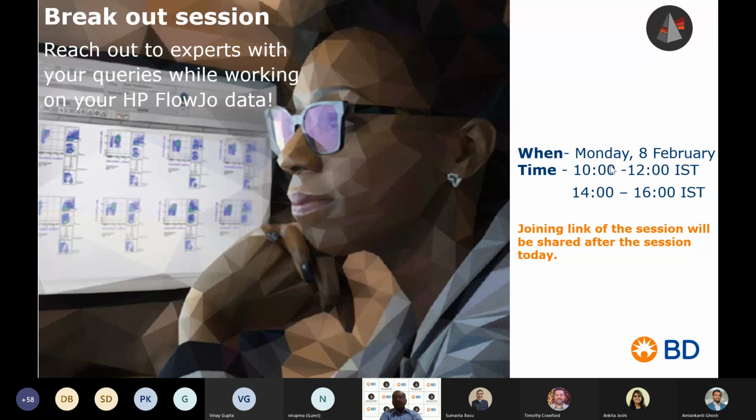Still, we request you to try the procedures at your end, and you will find them on the FlowJo Exchange site itself. If you find difficulty, please join this breakout session.